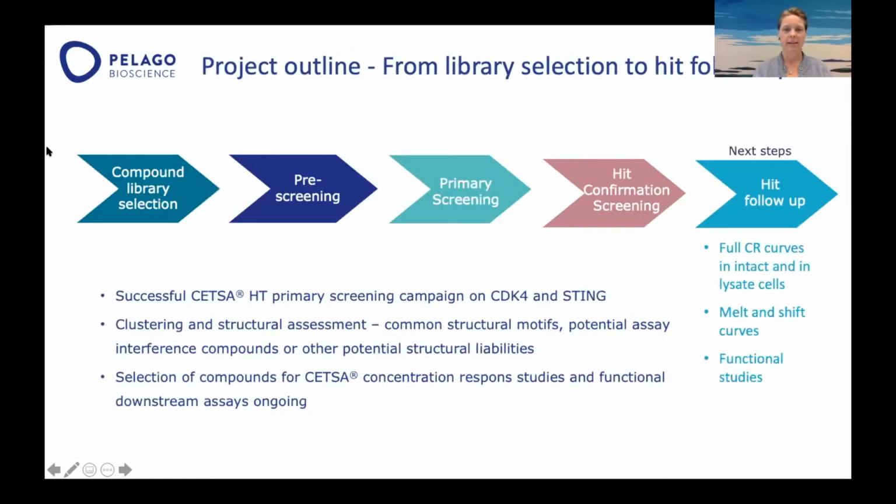So this is my last slide, just summarizing that we have done a successful primary screening campaign at Pelago on CDK4 and STING. We are at the moment doing cluster and structural assessment, and we look at common structural motifs, potential assay interference among the compounds, and also other potential structural liabilities. And we are at the moment selecting compounds for further functional studies and also more CETSA studies to confirm the hits.